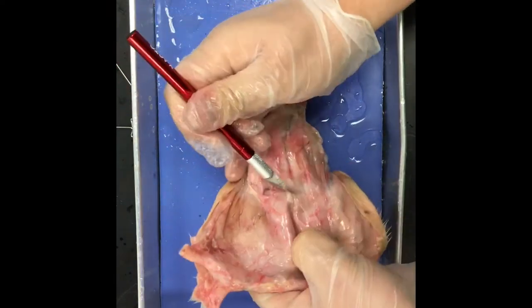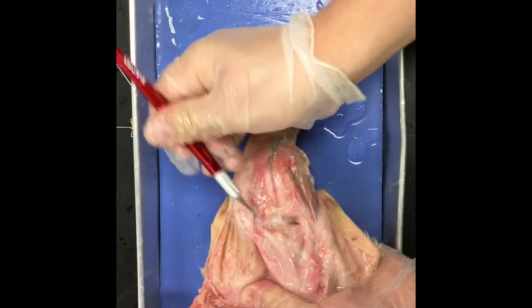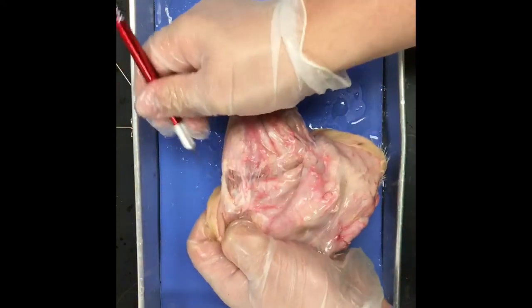What you're smelling is not dead rat. What you're smelling is propylene glycol. I can't even see any organs. You're not supposed to see any organs yet. This is just exposing the muscle underneath the skin.